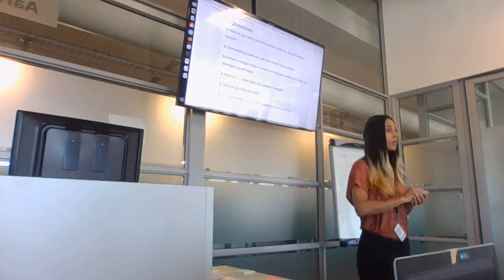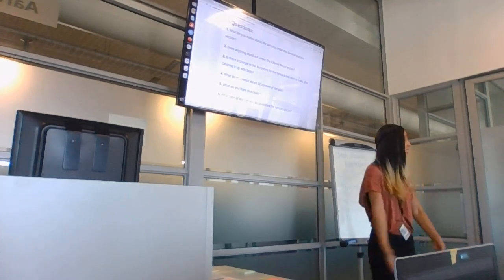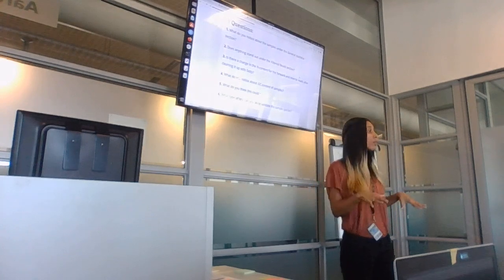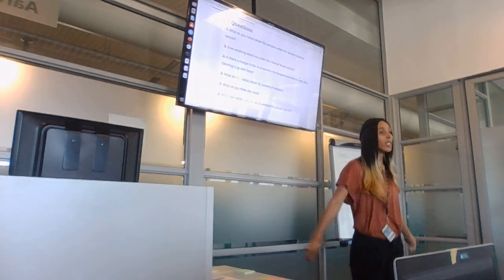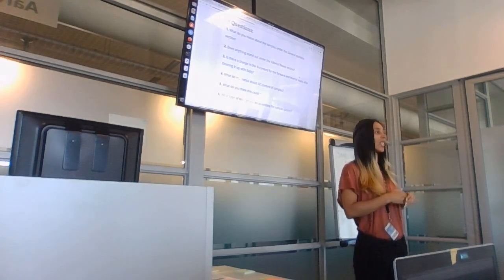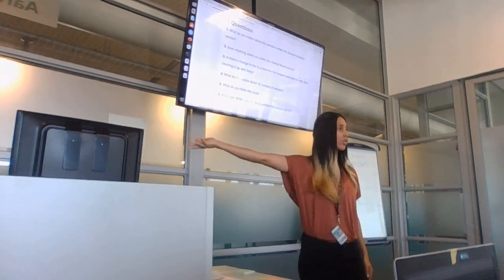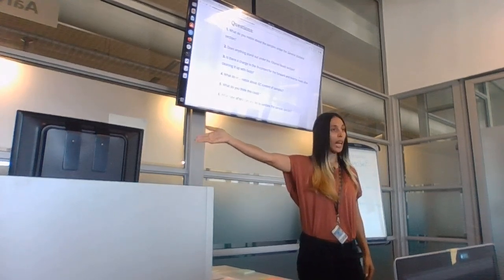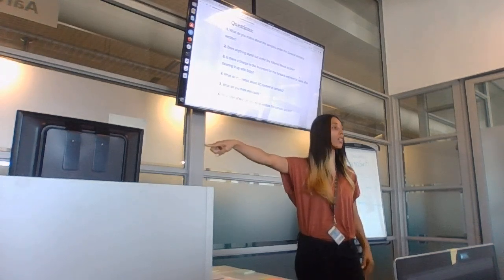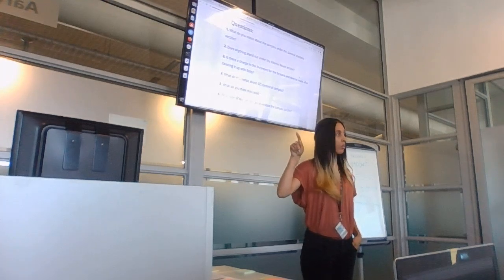You take a sample, they bring all the stuff to your computer to do your analysis, your extraction and everything. You've got your nice haversack with all of your equipment in there. You isolate your stuff. Let's pretend it's CSI, because everybody thinks that's how bioinformatics works. You've got your samples, you've sequenced and processed your data, and you see two samples don't look like the other samples.